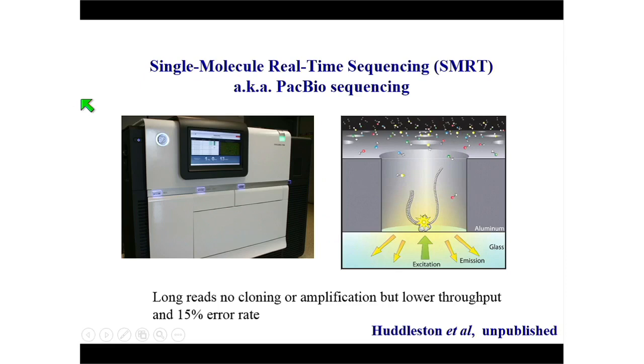So what is PacBio sequencing technology? Well, this is an instrument. This is actually a picture of the instrument that came to our lab about 4 years ago. It's a monster of a machine. It cost us about $1 million to get this instrument in, and it required about 10 weeks of engineers to make sure that the configuration of the floor was correct. We had to find a good space that would actually be load-bearing for this monster instrument.